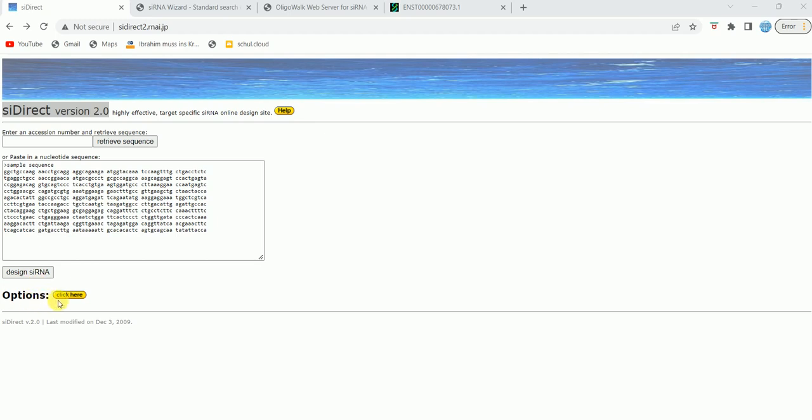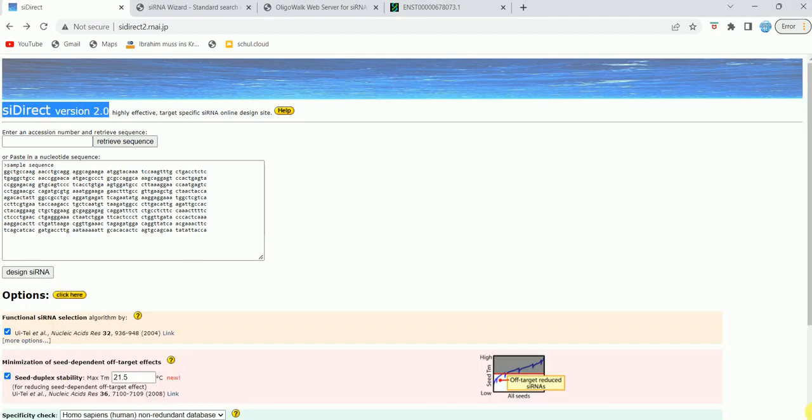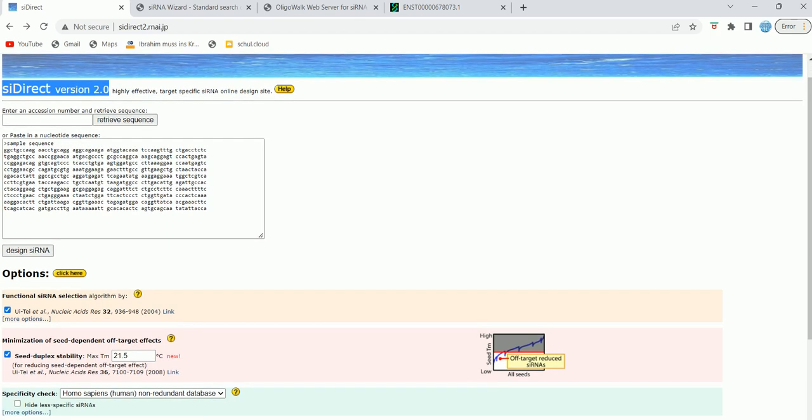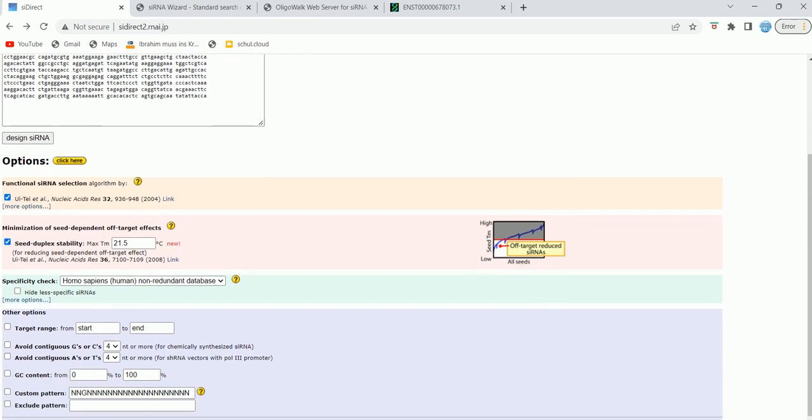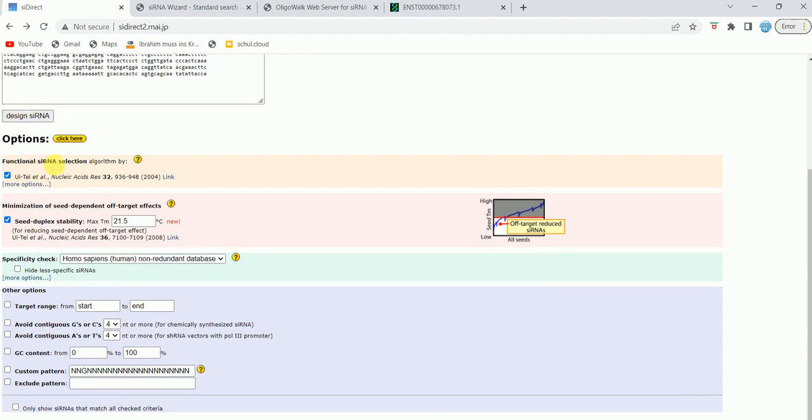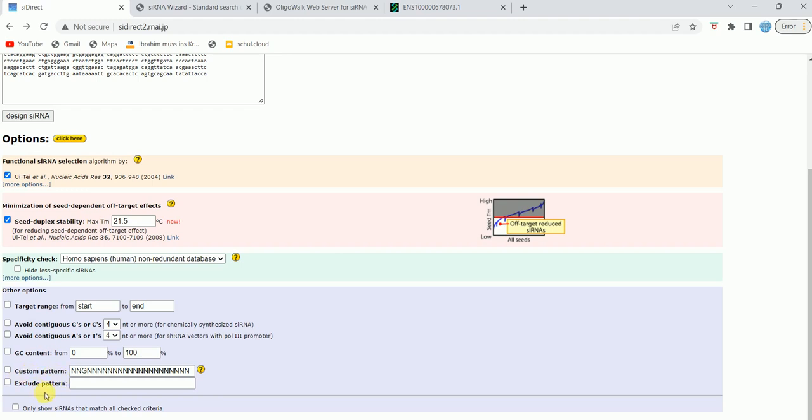But what I will do is I'm going to click on options because they also give us advanced designing of the siRNA. When I click on options, as you can see something like this shows up. Basically it gives us several options, for example functional siRNA selection algorithm, minimization of seed-dependent off-target effects, Tm of siRNA duplex, and there are also other options like target range, avoid contiguous G's or C's or contiguous A's and T's, custom pattern, and you can also exclude some pattern. These are the several options that you can utilize in this tool to design your siRNA against your target gene.